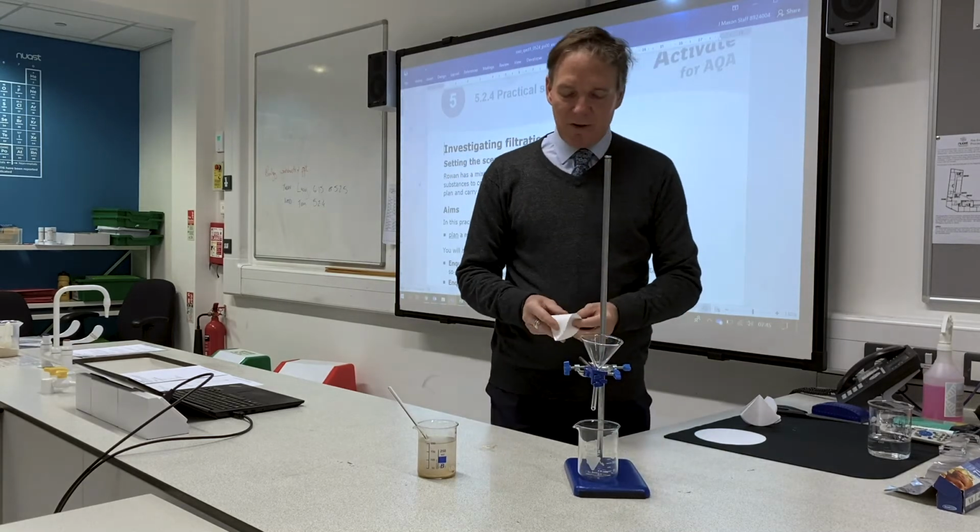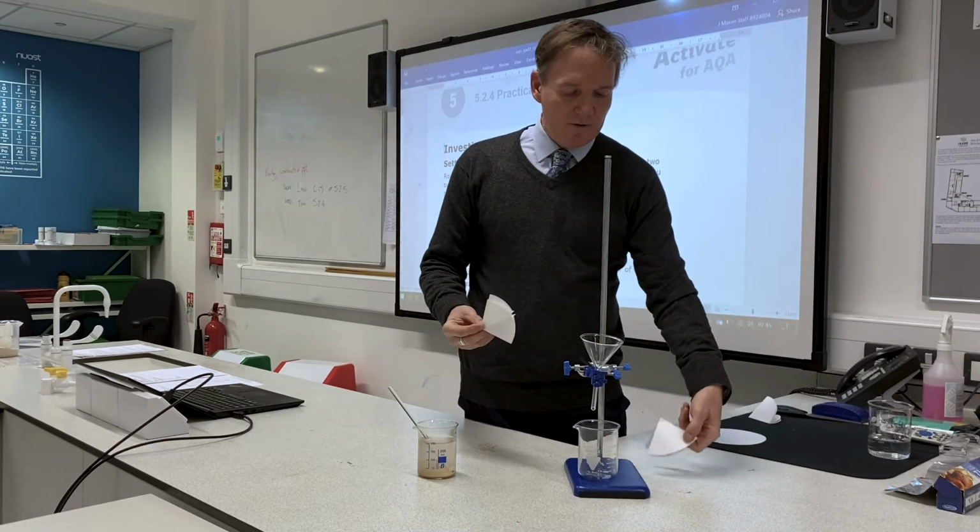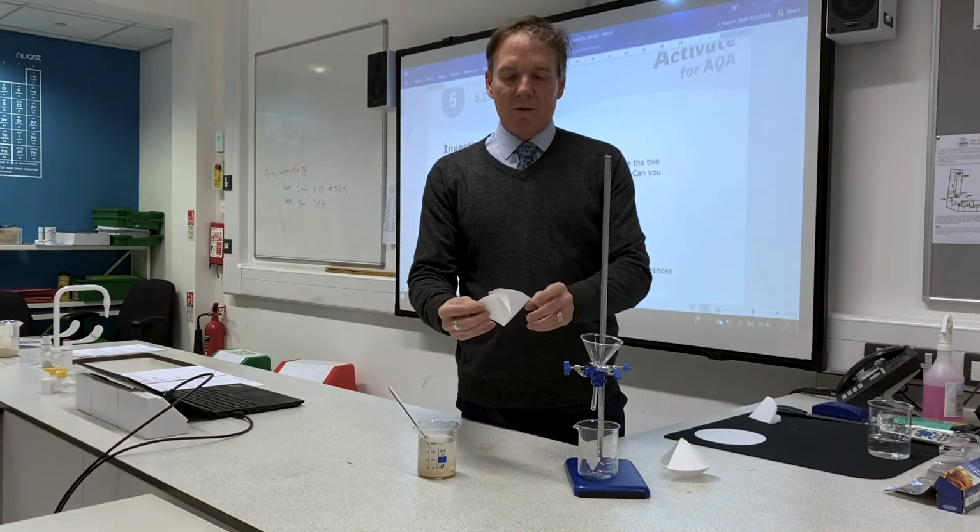Or if you're a bit fancy and you want your experiment to go a bit quicker, you can make your filter paper fluted, which is like this.